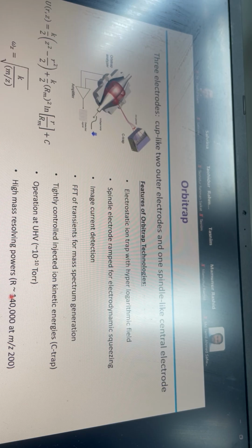So that's why you can measure with very high resolution. You can identify molecules with high resolution, very low mass error, and very high mass accuracy, only 1 to 3 ppm typical. Okay, because you use ultra high vacuum.